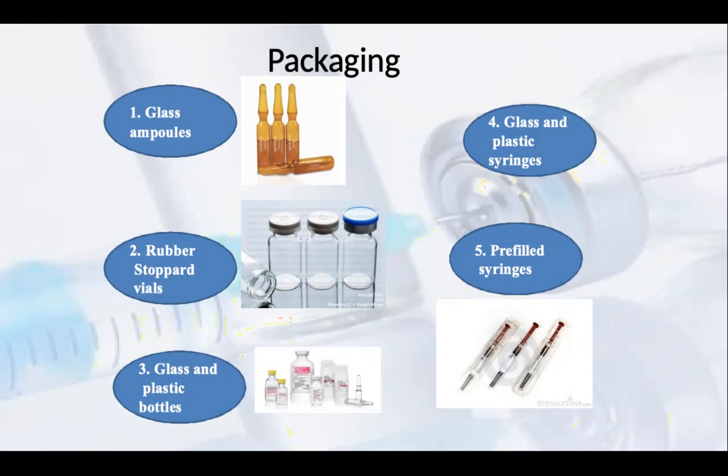Nowadays some drugs are in pre-filled syringes, or in good hospitals the drugs are reconstituted in syringes or other devices.